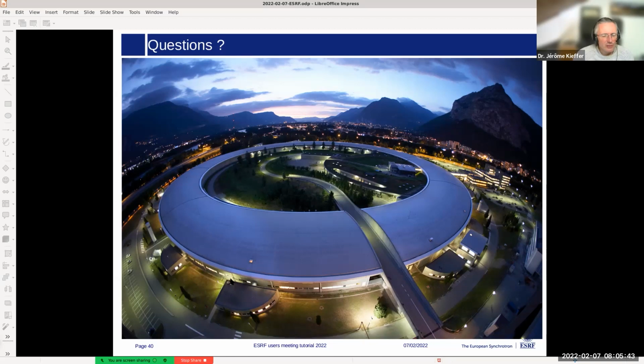And this is used for XPCS. So okay, so not exactly some custom Eiger, right? Yes, it's a custom Eiger. I don't advertise the Eiger 2 generically to be operating at 20 kilohertz. It's one module, it's one specific beast. Perfect, thank you. So talking about geometry, you have shown this example with moving panels. Do you save geometry for each panel in H5 file, or how do you save it? How it's done usually, no, we share the whole detector into one file.